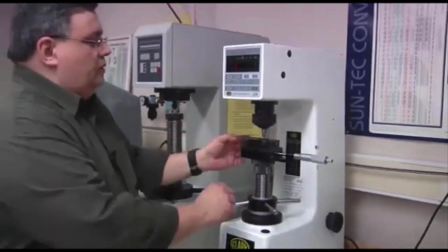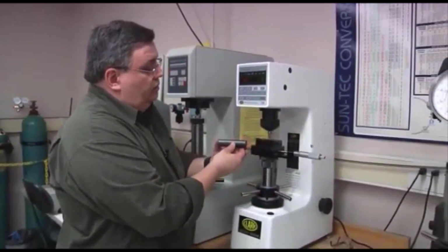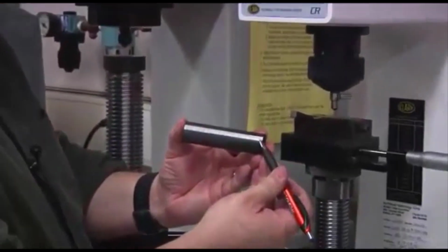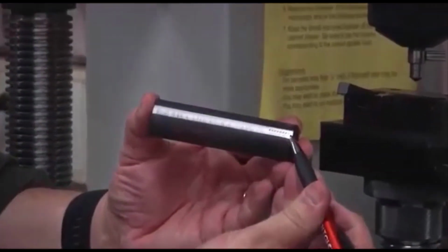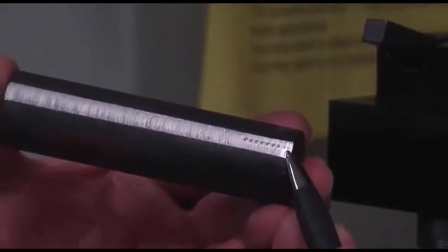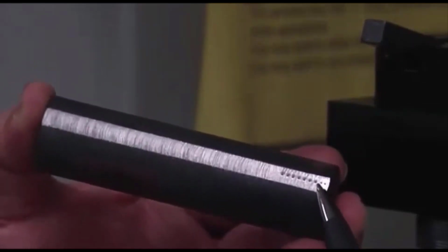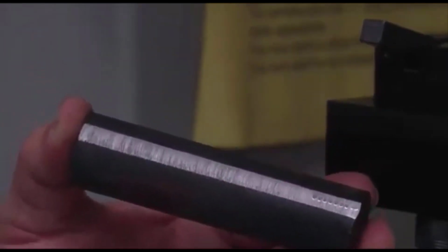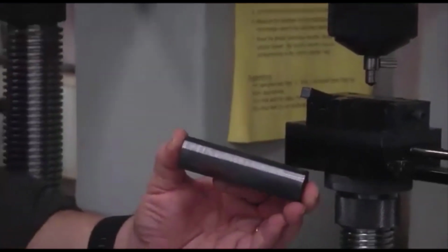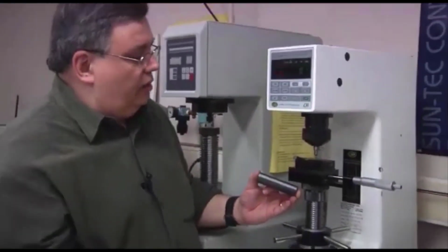testing this bar. So I'm going to remove the bar, and you can see both from the surface finish, at the end it's shinier, and you can see, if you look close up, that the indents for the first two are much smaller, indicating that we have a much harder material here. So our martensite layer is very thin, and then the hardness drops very rapidly as the quenching process, cooling process, formed bainite and pearlite, mostly pearlite, instead of martensite.